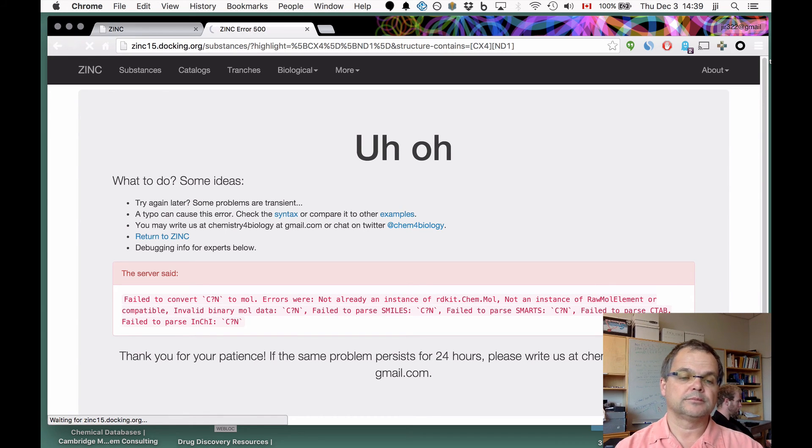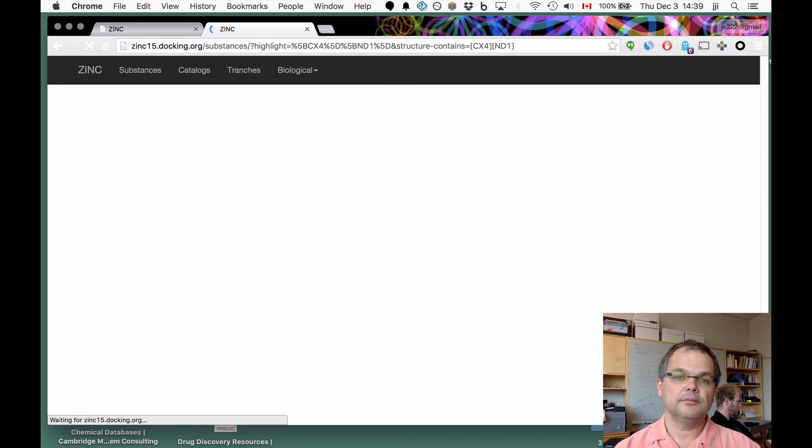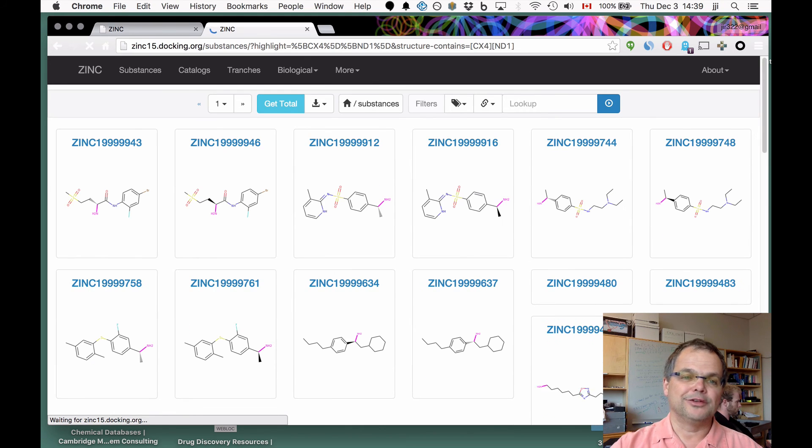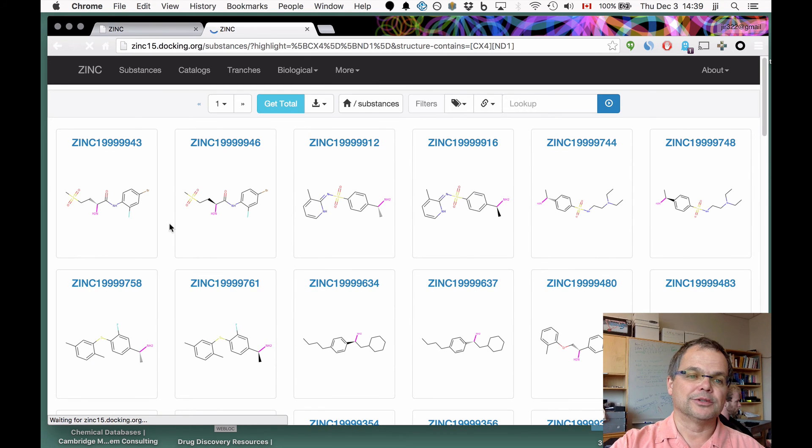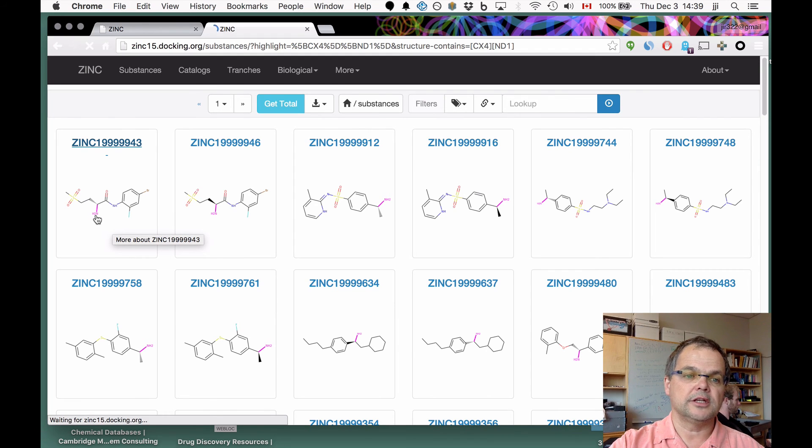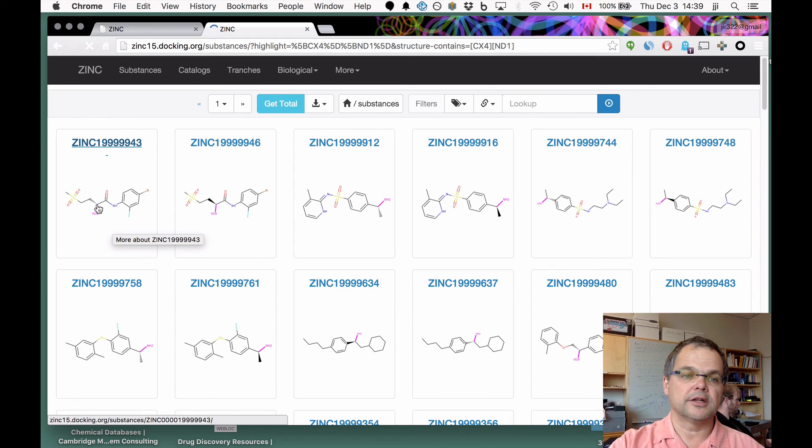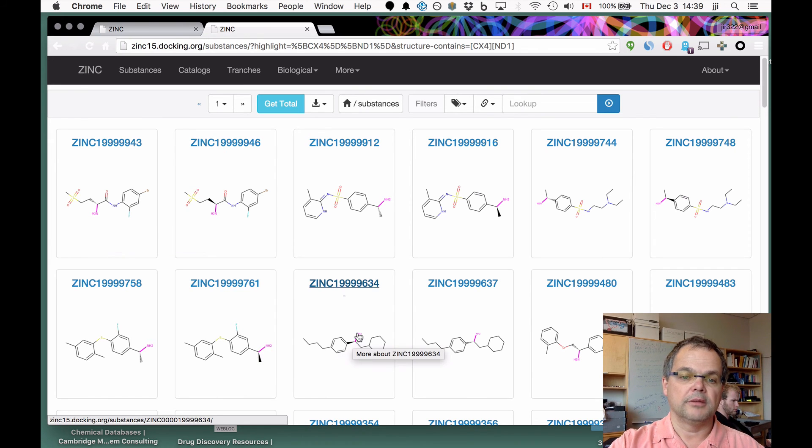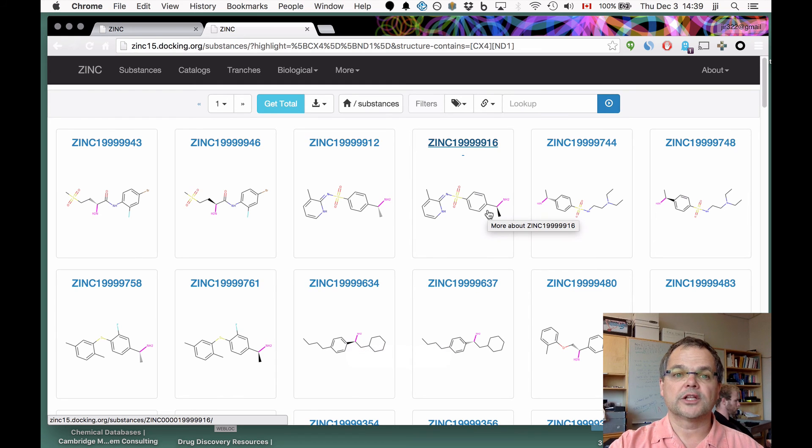However, if you edit the URL and just put in CX4ND1 up there and do that, then it will find you molecules containing primary aliphatic amines. There's the amine and the tetrahedral carbon, amine tetrahedral carbon, amine tetrahedral carbon, amine tetrahedral carbon. That's sort of fun.